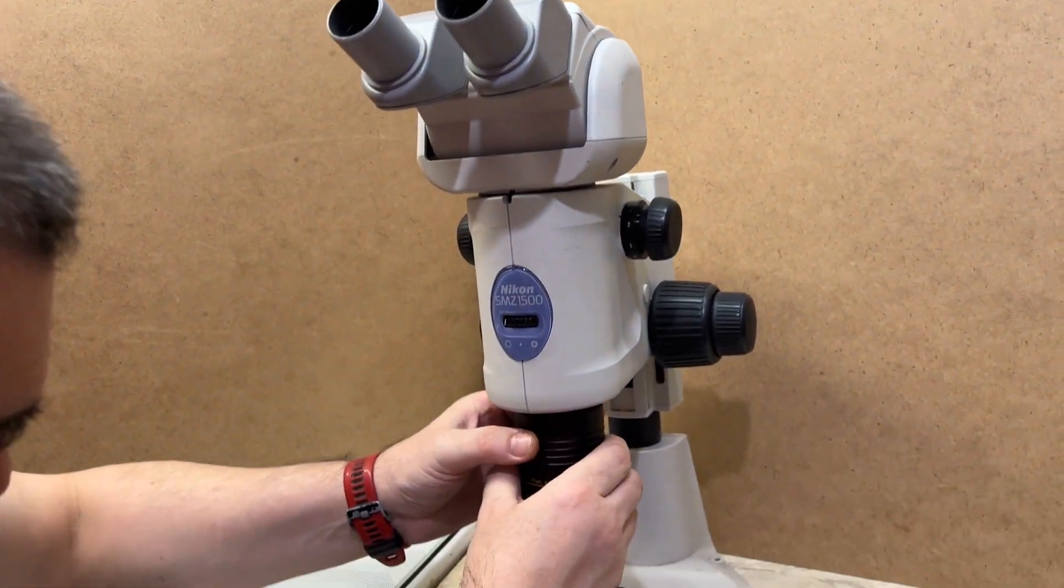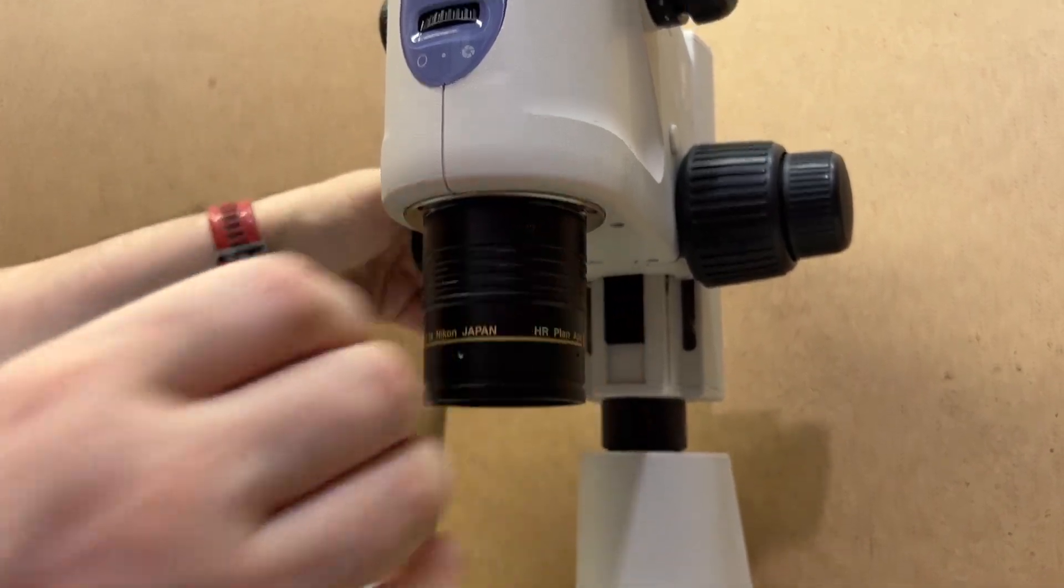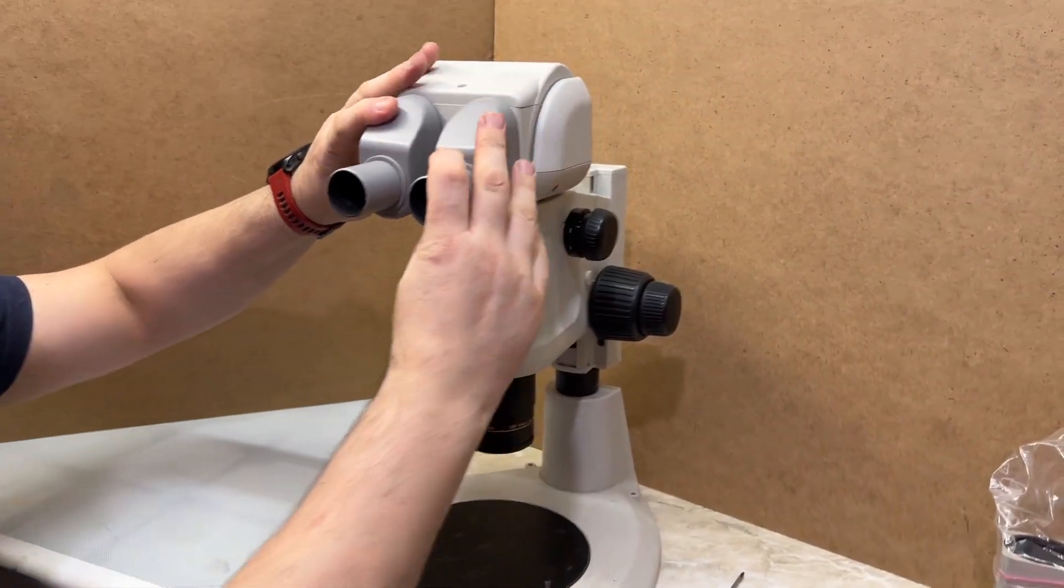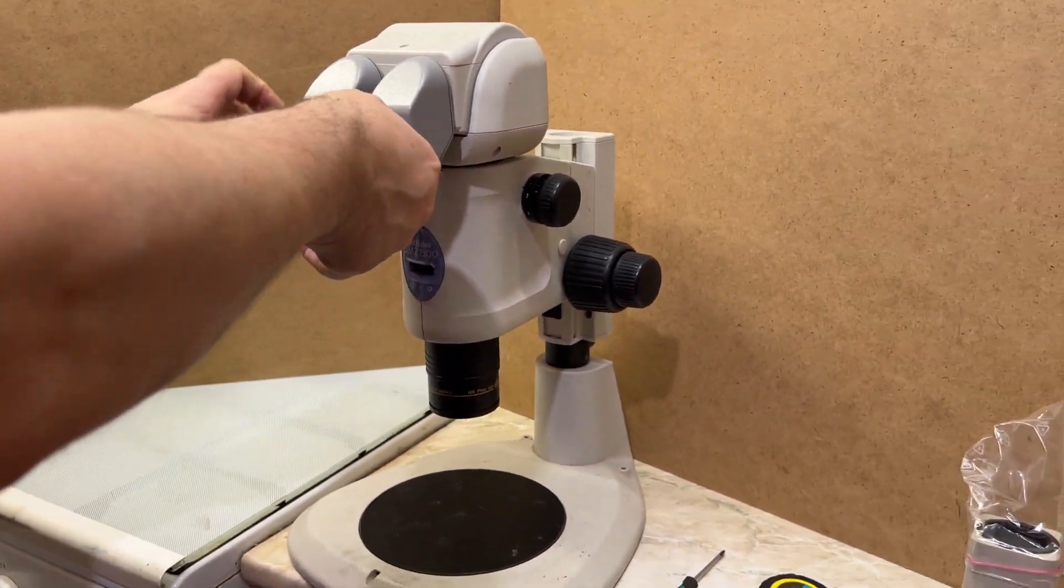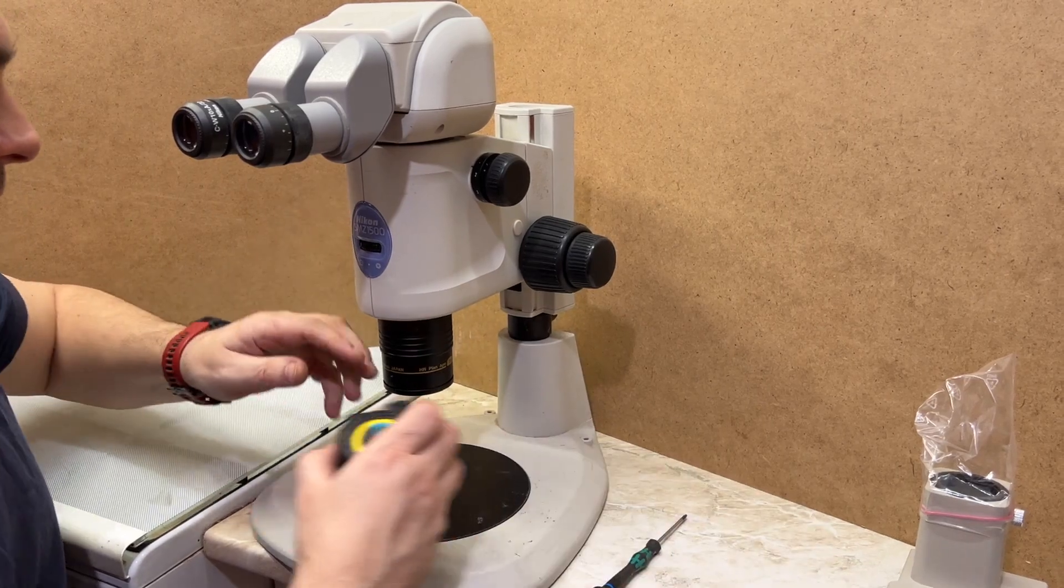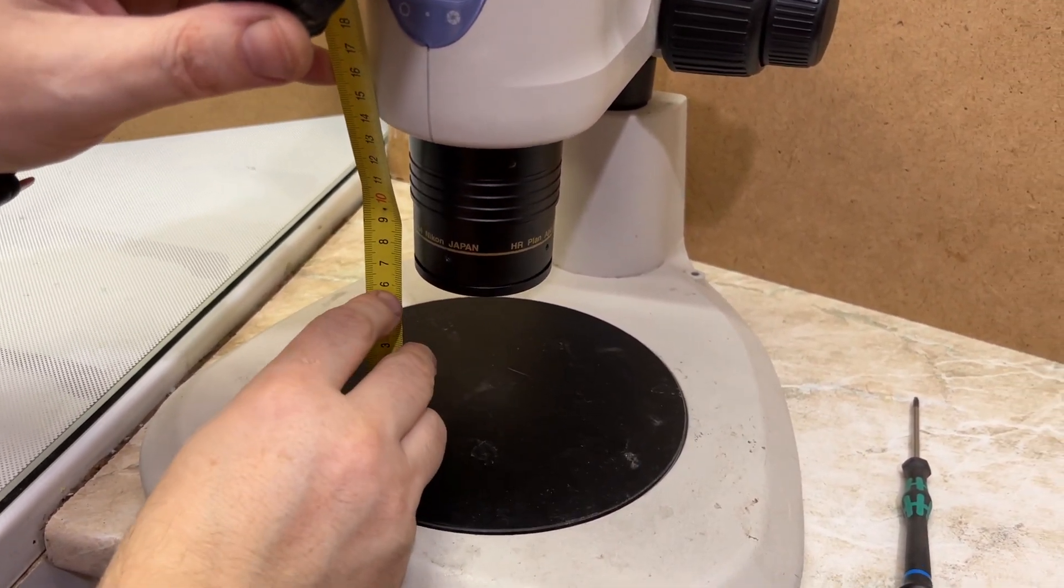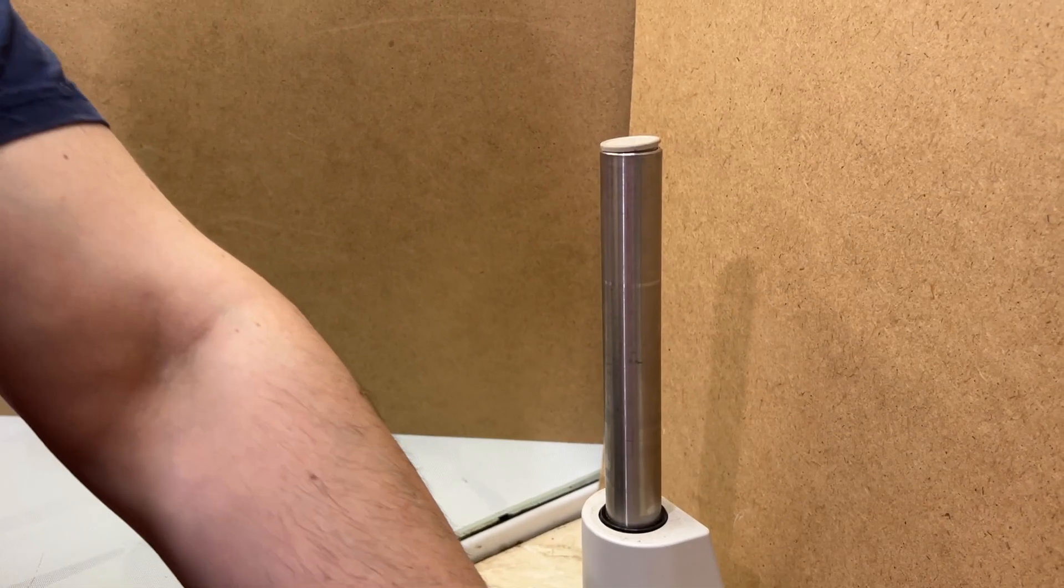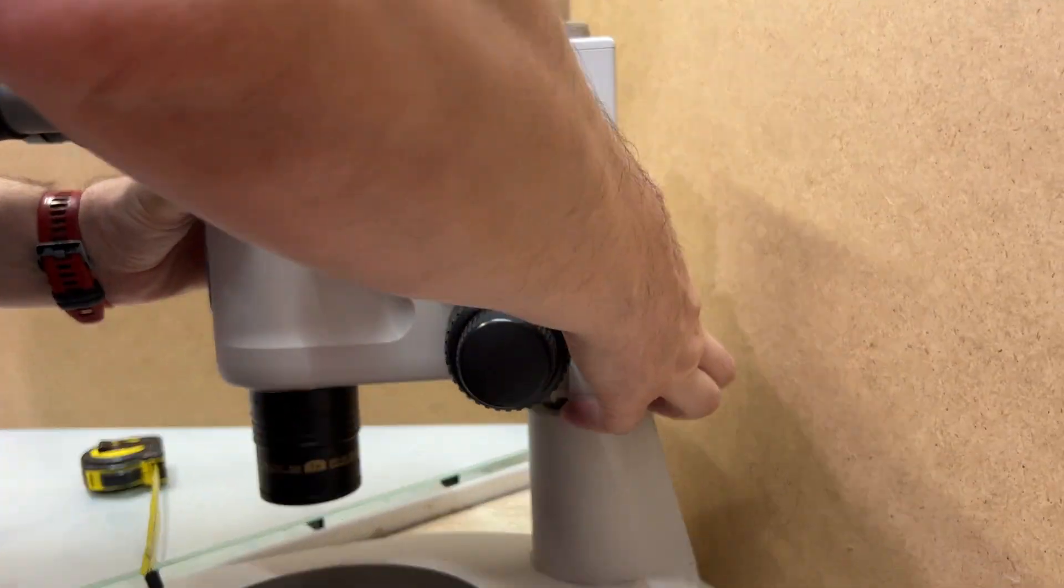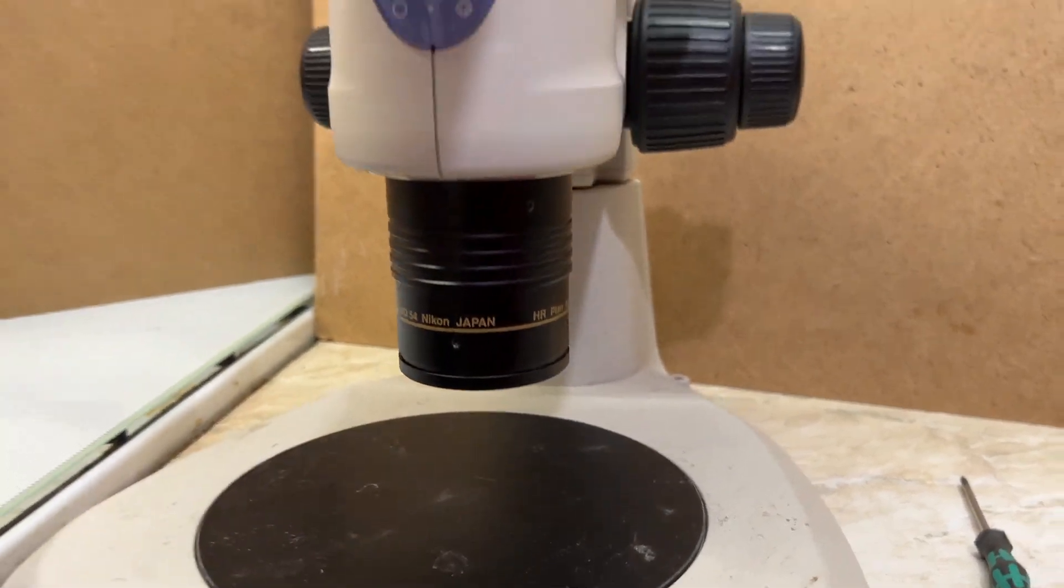After that we need to screw in our objective. It's a huge brick of metal. We can't reach it because we have this ring. We need to take it away, we don't need it in our case. Now we can easily reach our 54 millimeters working distance with this objective.